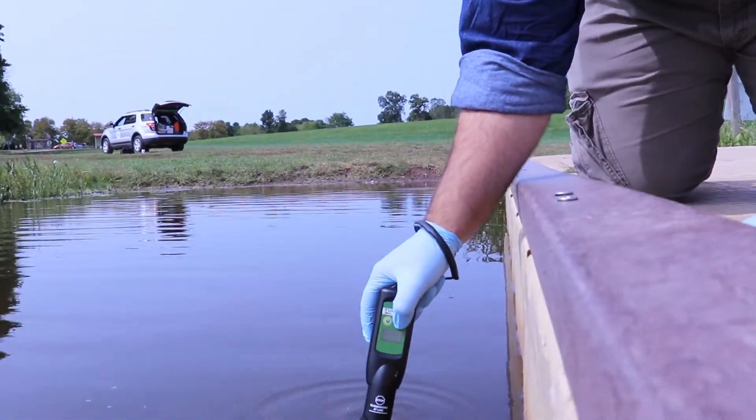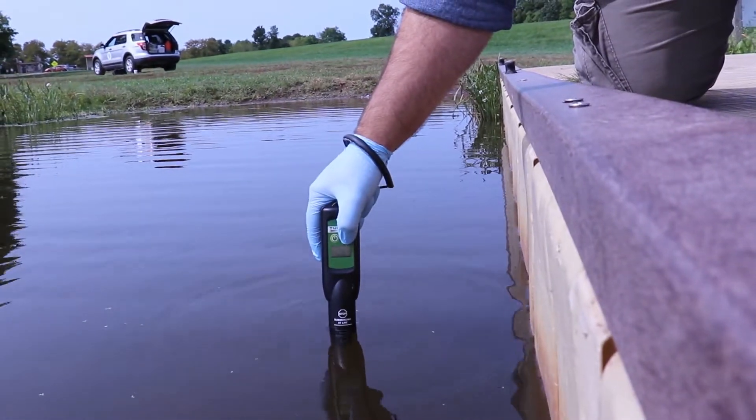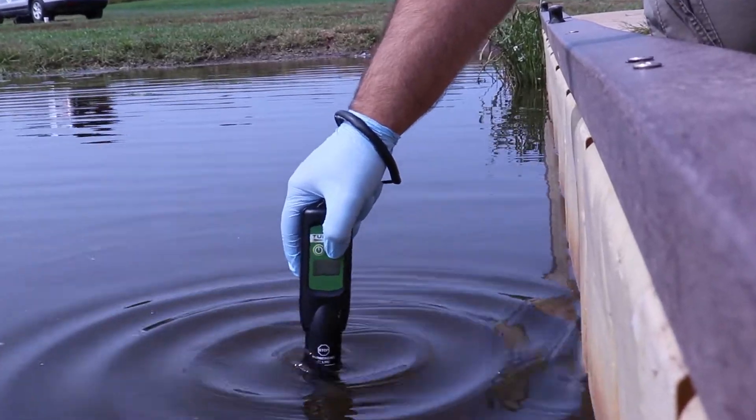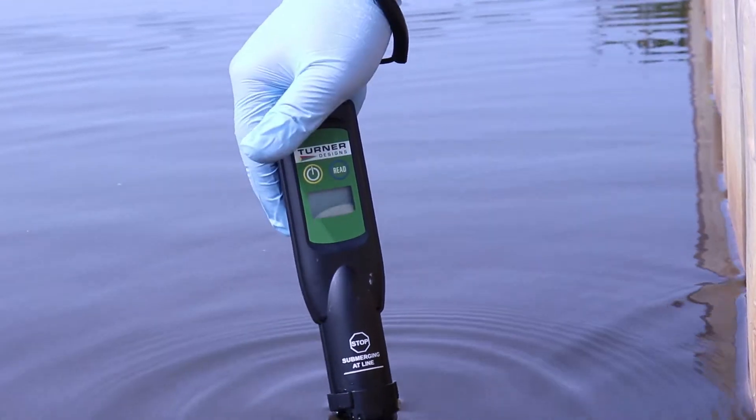Before you take any readings or use the meter, make sure you put on gloves, because if there is a HAB in the water, you do not want that cyanobacteria to get on your hands. Once you have gloves on, take your meter and turn the power button on. Then submerge your meter up to the line, and once submerged, gently shake it to make sure any water bubbles stuck in the cap are removed. Then press read.